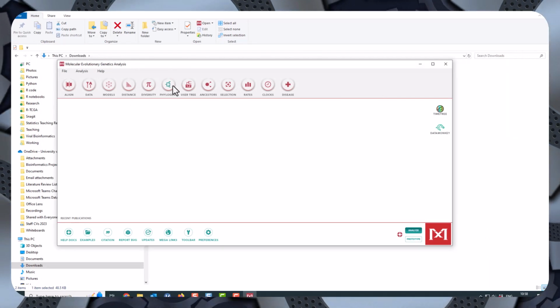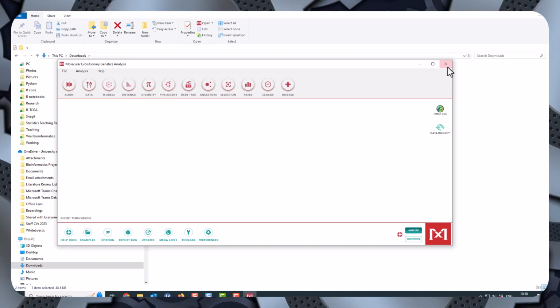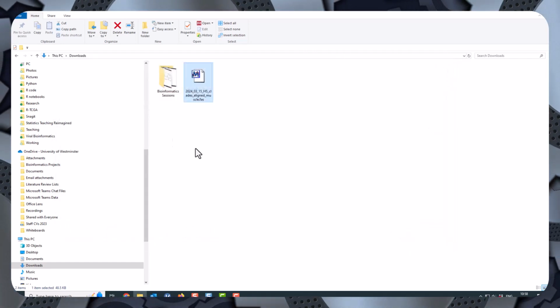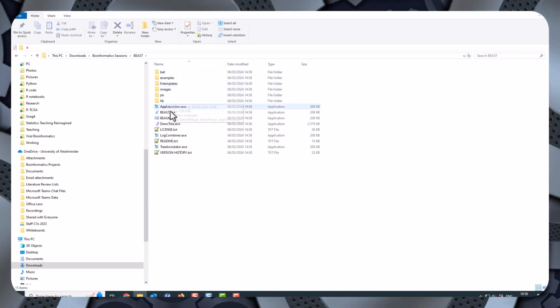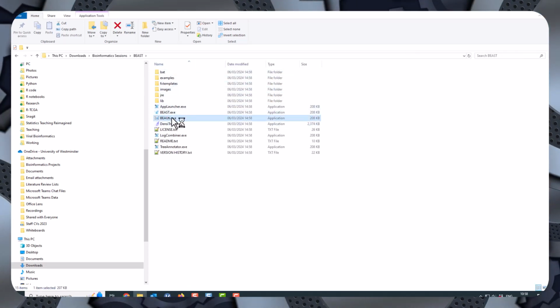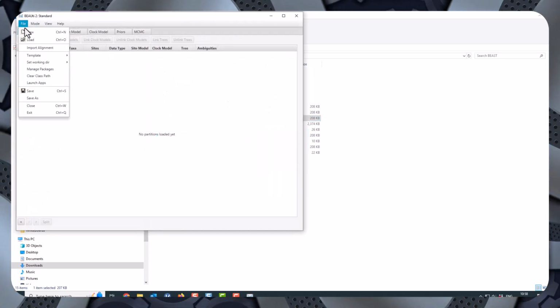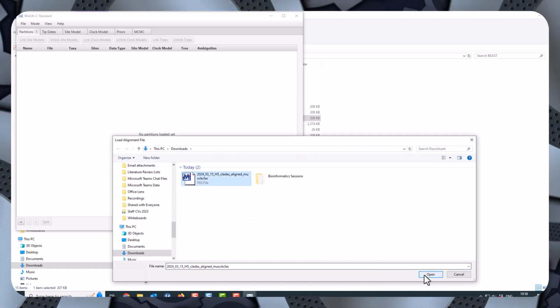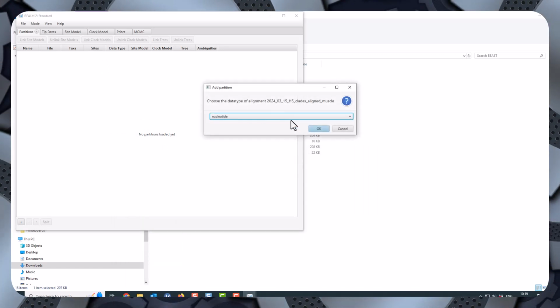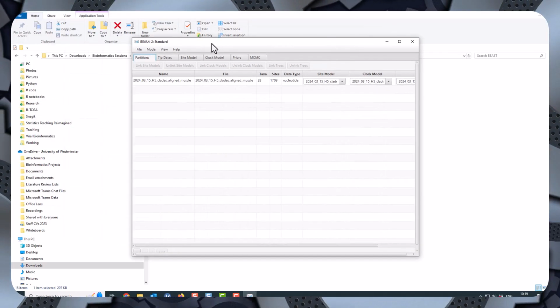So I could create a normal phylogeny using MEGA, but because I want to include the dates, I'm going to use Beast. So the first thing is to use BEAUti, which you use to read in the sequence files. So you import the alignment, and that's my first set of data. It's a nucleotide sequence, that's all fine, and that's good.